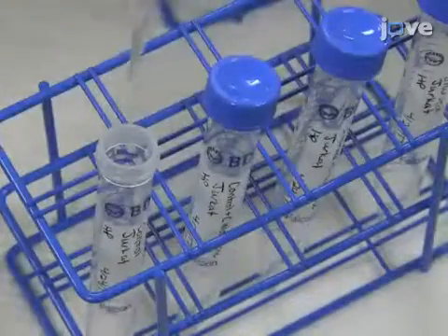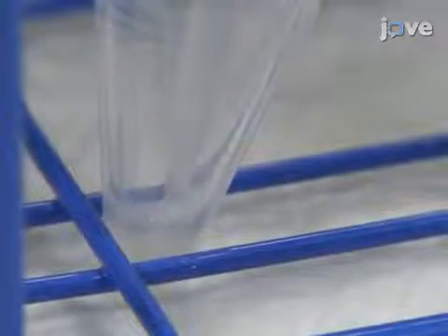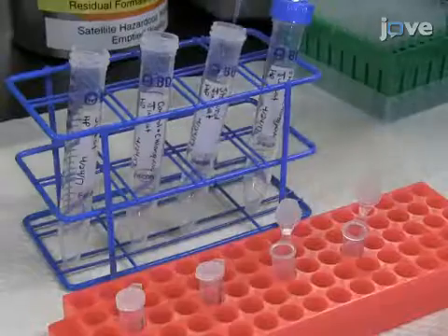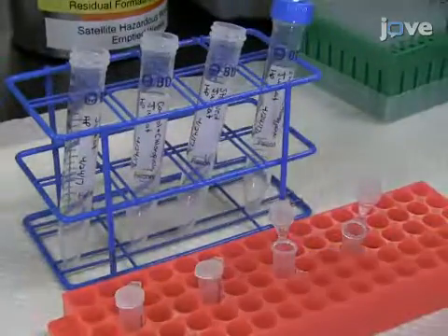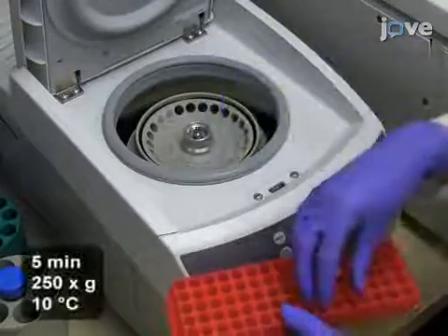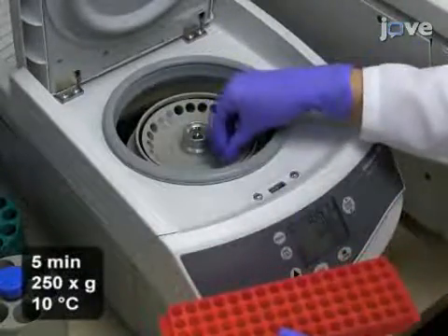Re-suspend the pellets in 100 µL of 4% formalin. Then, transfer the samples to labeled siliconized polypropylene microcentrifuge tubes. After 10 minutes at room temperature, wash the samples in 1 mL of fresh wash buffer.